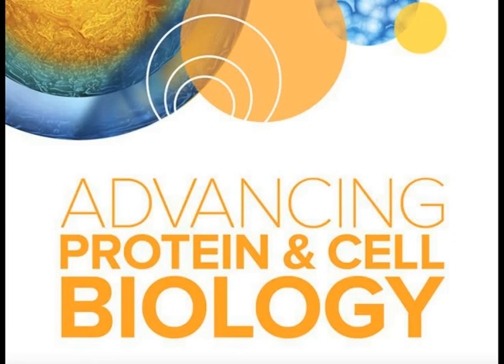So Oksana, did you do any normalization of your calcium live cell signal to number of nuclei per spheroid or anything like that? In fact, it was done automatically because the numbers I chose to be reported were average intensities of cell cytoplasm.